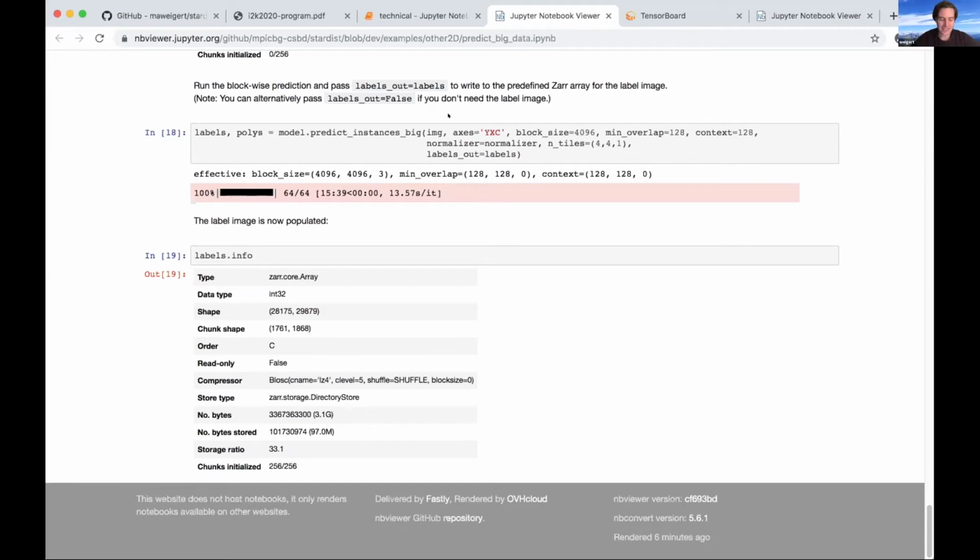Yeah, my point is that what works best depends very much on your data. And here, everything that is a publicly exposed function should be pretty foolproof, in deep learning nomenclature. This is something where you really have to experiment a little bit. Of course, you could just do it yourself, but including that would mean we would have to carry out a lot of research just to find reasonable defaults, and that's why it's not part of it. But it's totally true, you can just fine-tune it with a small learning rate, for instance. That's what people do.